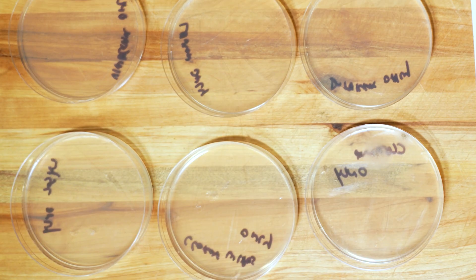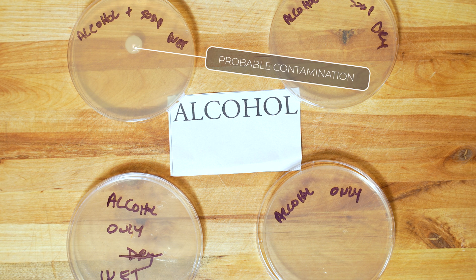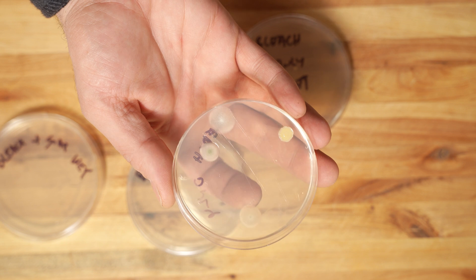Not all the results were positive. In the second round, I smeared the board with chicken, bypassed cleaning with soapy water, but did allow the disinfectants to dry. All disinfectants killed the bacteria from the chicken except one — can you guess which one? It was the bleach solution. That is very surprising. The alcohol, when applied and tested both wet and dry, produced no cultures. The bleach, both wet and dried without soapy water, did grow bacteria. That's disturbing since in the restaurant industry we wipe down everything with bleach solution all day long. Granted, we never wipe a cutting board contaminated with raw food using sanitizer alone — but it's clear that bleach should only be used after cleaning with soapy water and must be left to dry.